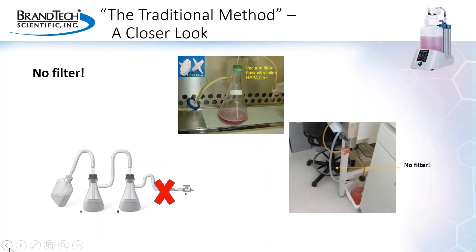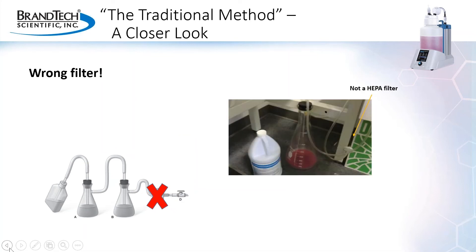Another safety consideration when performing fluid aspiration in the lab is the aerosols that are generated during the aspiration process. Both the vacuum source and the lab environment should be protected from these aerosols by a HEPA filter in place between the overflow flask and the vacuum source. However, oftentimes the filter is simply non-existent, or when a filter is used, it's not the correct type to afford adequate protection, providing a false sense of protection.